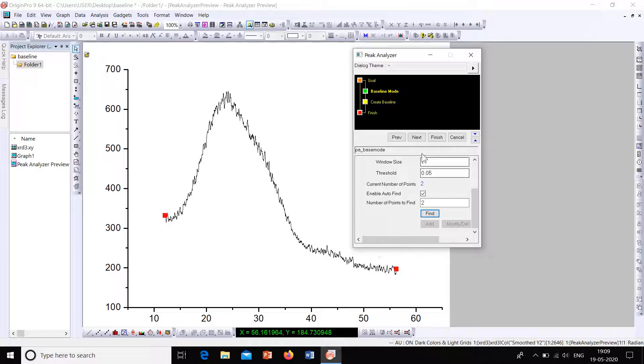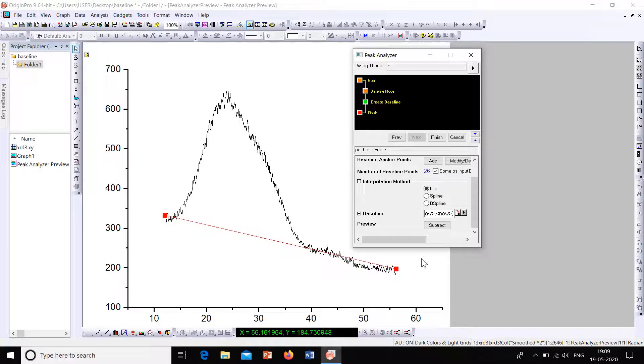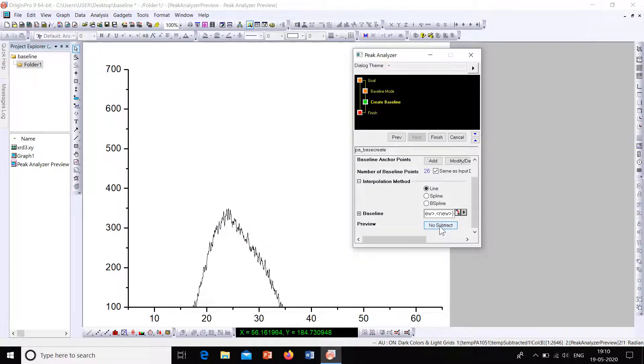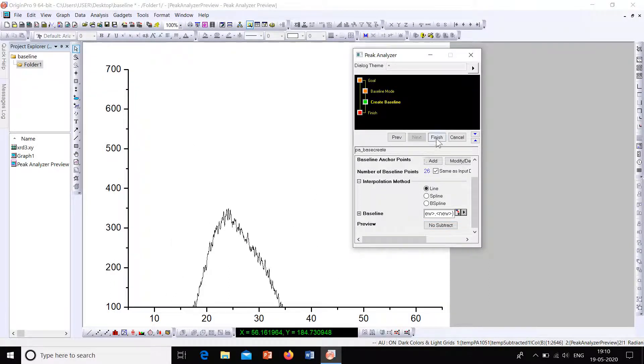Now click onto Next. So this is the baseline that is created. You can adjust these points and create a better baseline. Now click onto the option Subtract. Now our graph is ready. Now click onto Finish.